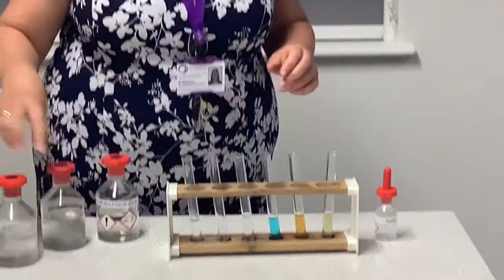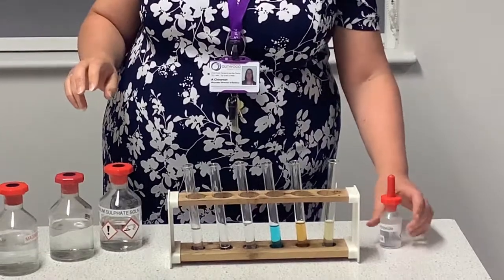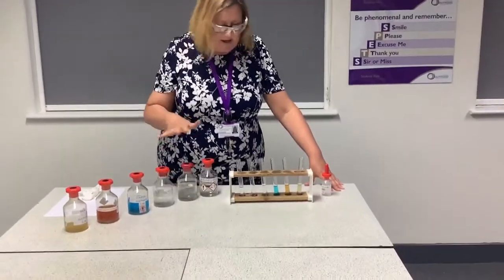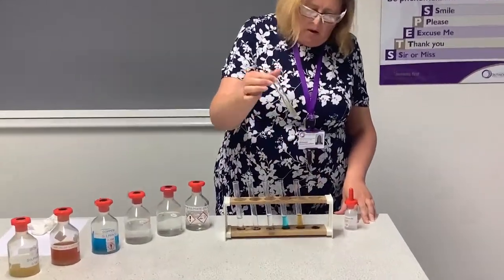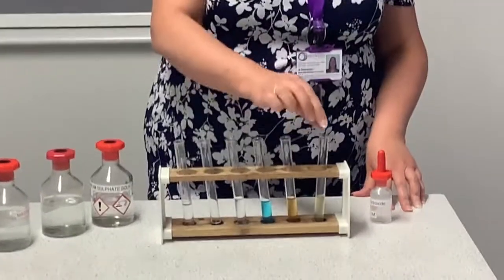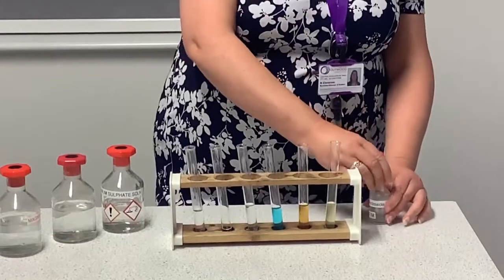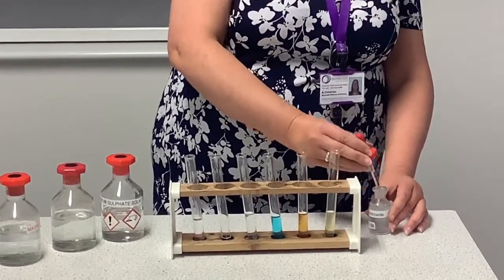Test using the alternative test for positive ions, which is the sodium hydroxide precipitate test. So I've got some samples of solutions that all contain metal ions, and these are the ones that you need to know for the exam. The first one, there's actually two different versions of iron ions. There's an iron 2+ and an iron 3+, and we're going to test them, and it's very easy to see, hopefully with the precipitates, the difference between them.